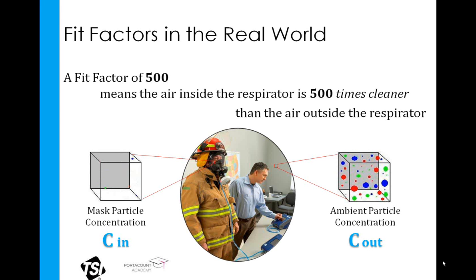We really want to make sure that you achieve the minimum required fit factor set by your standards. For OSHA, that's 100 for half face and filtering face pieces, and 500 for full face respirators. We just need to achieve the minimum. The fit factor difference between 10,000 and 20,000 and 30,000 is really minimal when you look at the protection that you're actually getting.